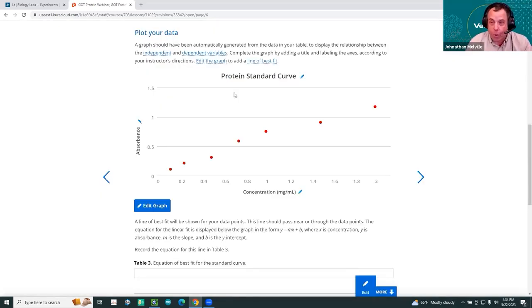And that brings up a good point, is that I really never knew what Beer's law was. I'd heard Beer's law before. To me as a biologist, I just knew what standard curves were. So you created a standard curve. Beer's law just refers to, with the spectrometer, if you're creating a standard curve with known standards, the absorbance is going to change linearly or proportionally. So they're kind of interchangeable in this case. Beer's law is very specific, but we've created a standard curve.